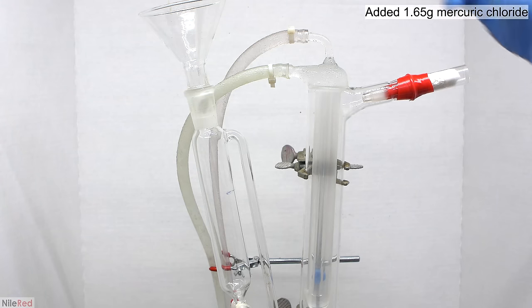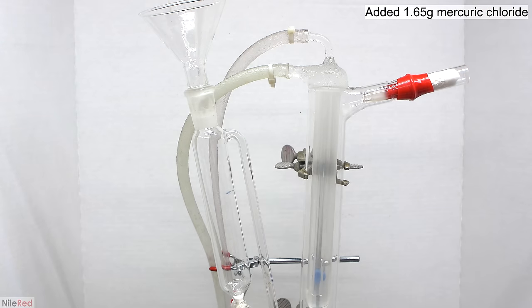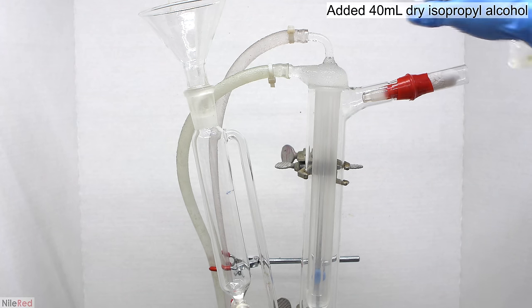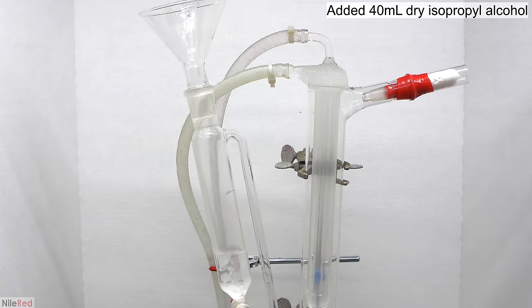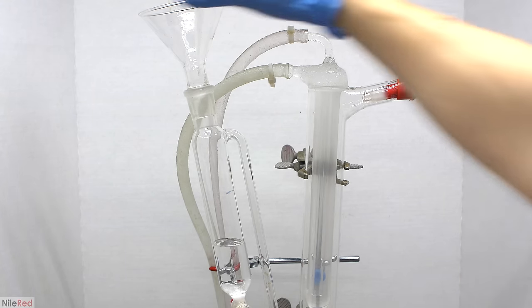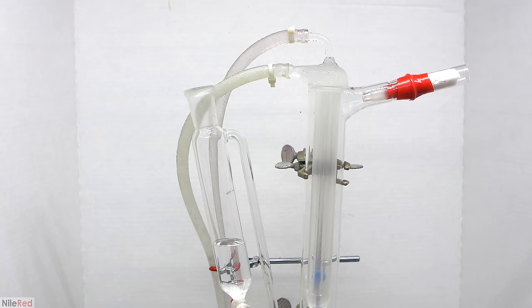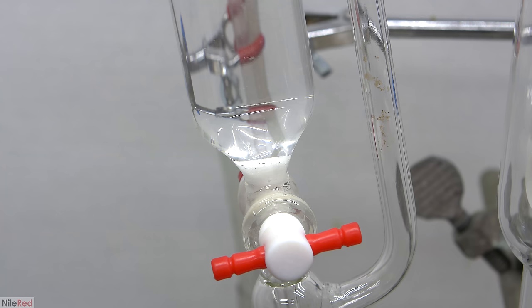While the other things are in the reaction flask, I start to prepare the mercuric chloride solution. I added 1.65 grams of mercuric chloride to an addition funnel, then poured in about 40 milliliters of dry isopropyl alcohol. I moved it around to wash down any mercuric chloride left behind. When we look closer at the addition funnel, a lot of the mercuric chloride still hasn't dissolved. It's not very soluble in isopropyl alcohol, and to get it to dissolve, we're going to have to heat things up.